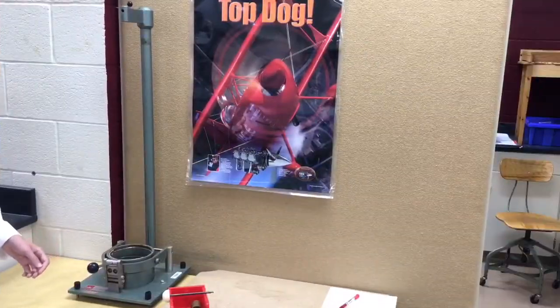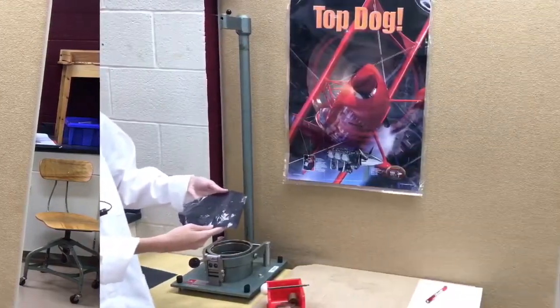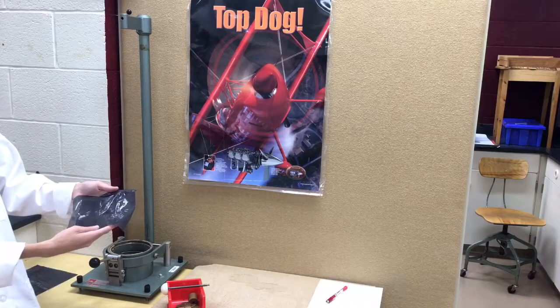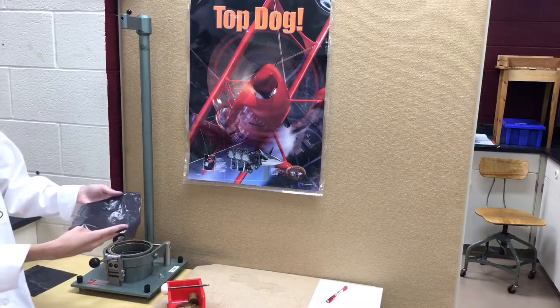The necessary safety precautions for this lab are a lab coat, similar to this one I'm wearing, and safety glasses. For this lab you'll need a little over 20 pieces of 7 inch by 7 inch plastic film samples. We'll be using 4 different materials and the lab necessitates 10 breaks for each sample.